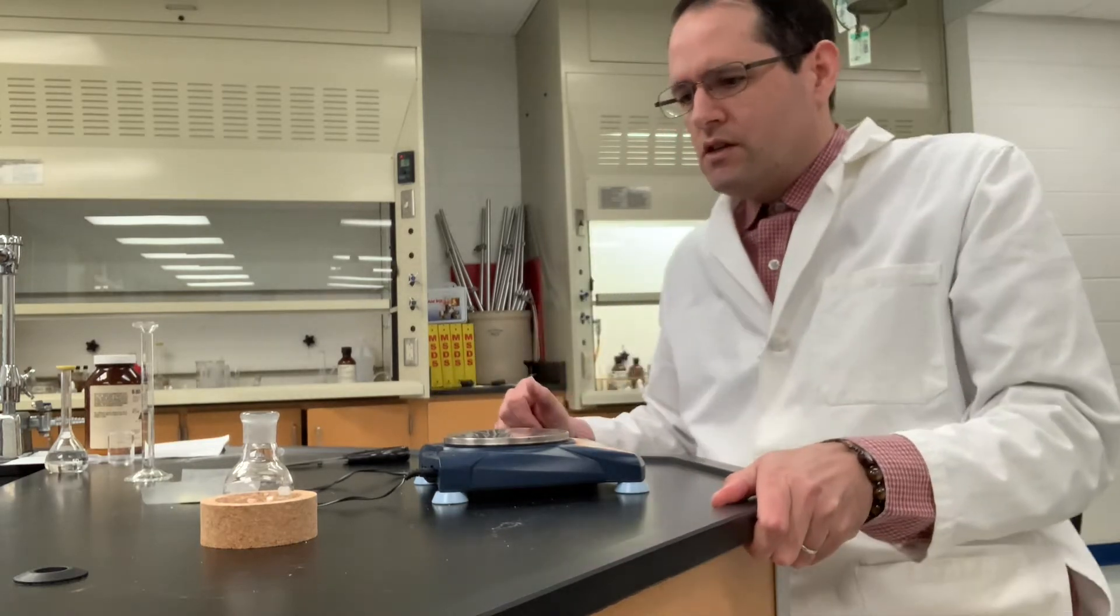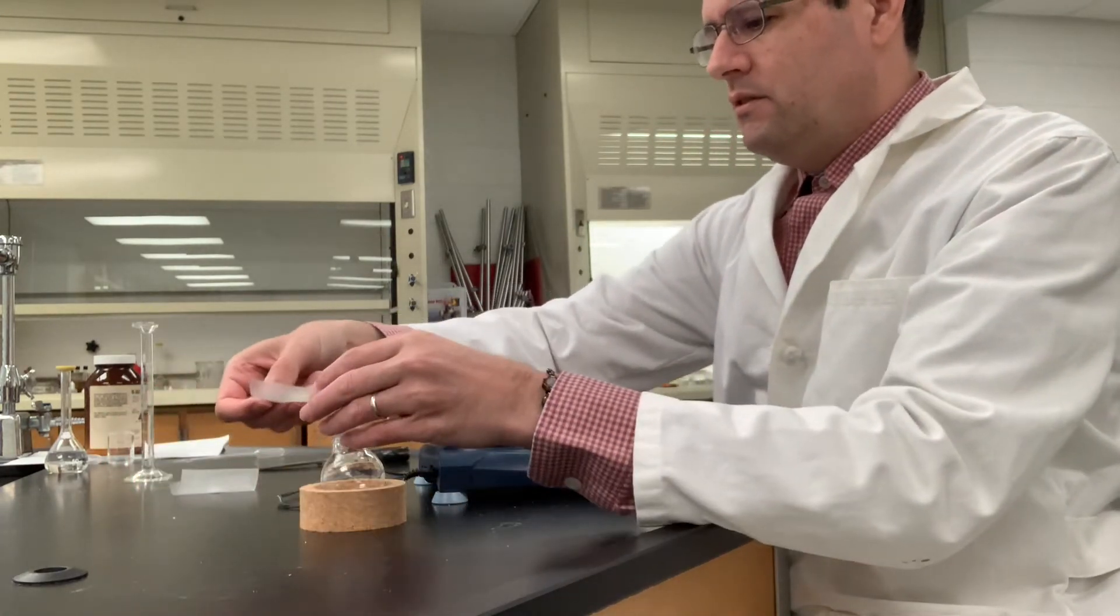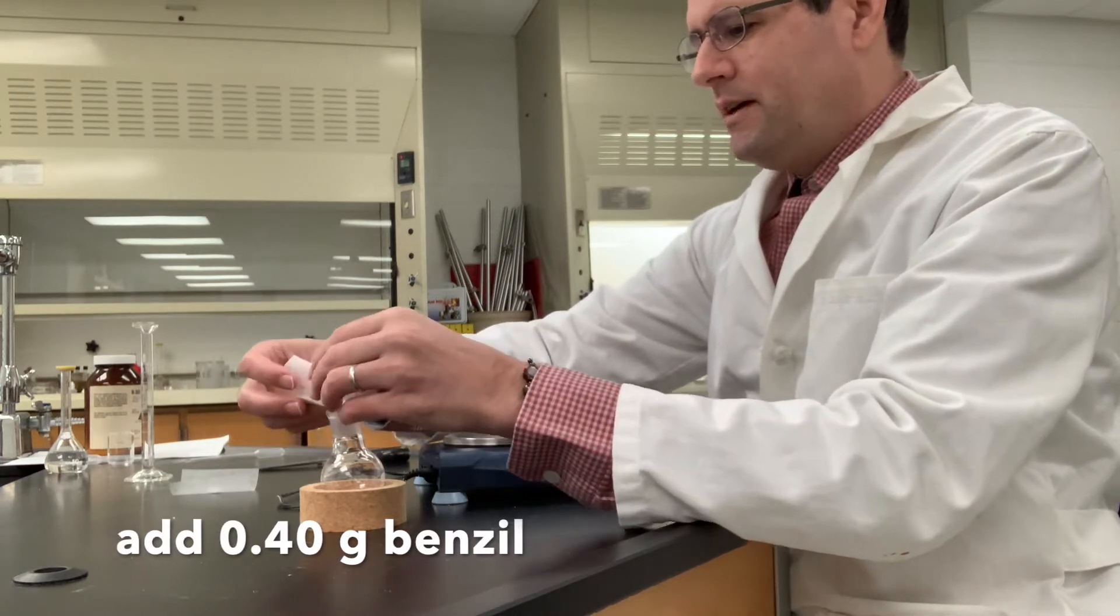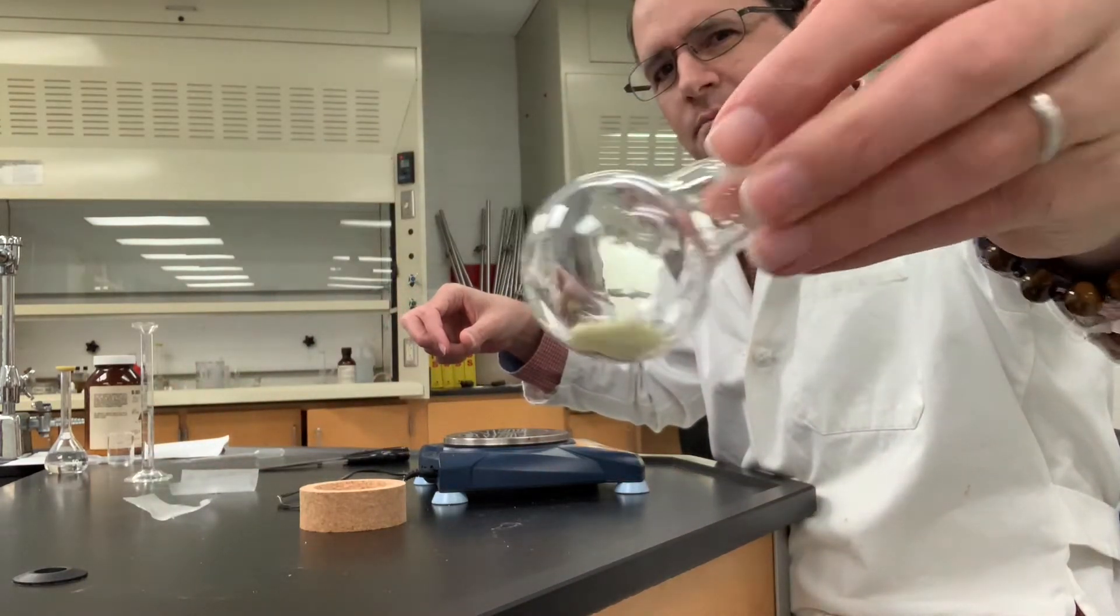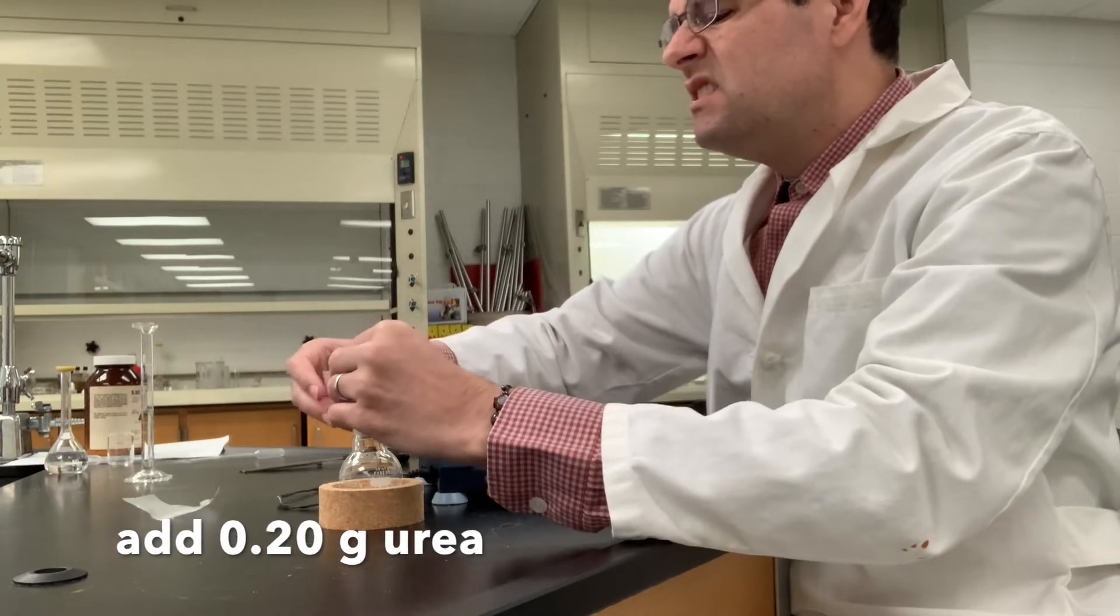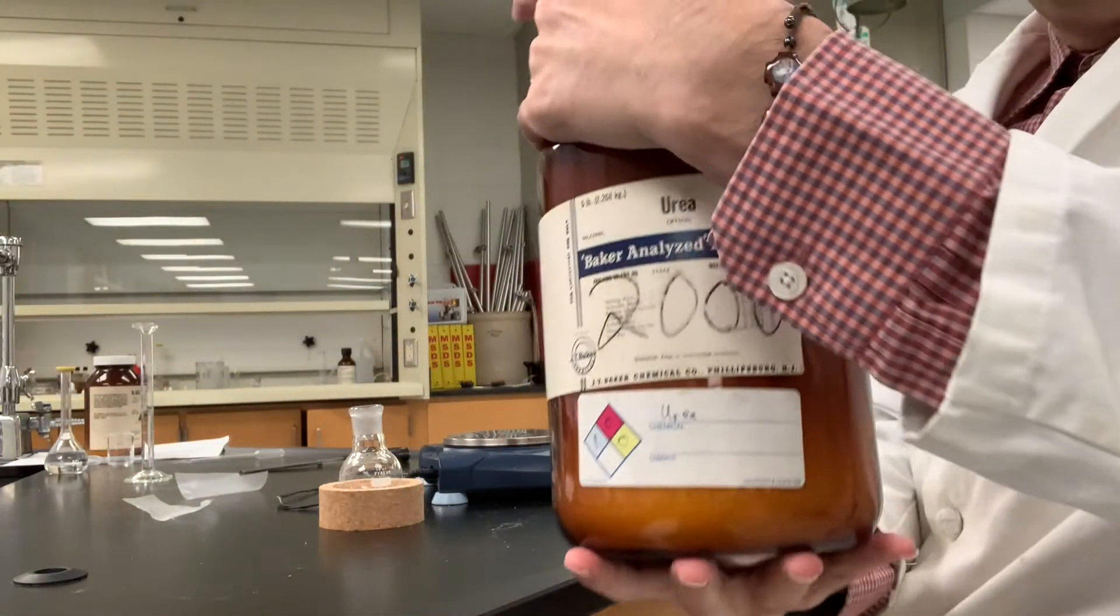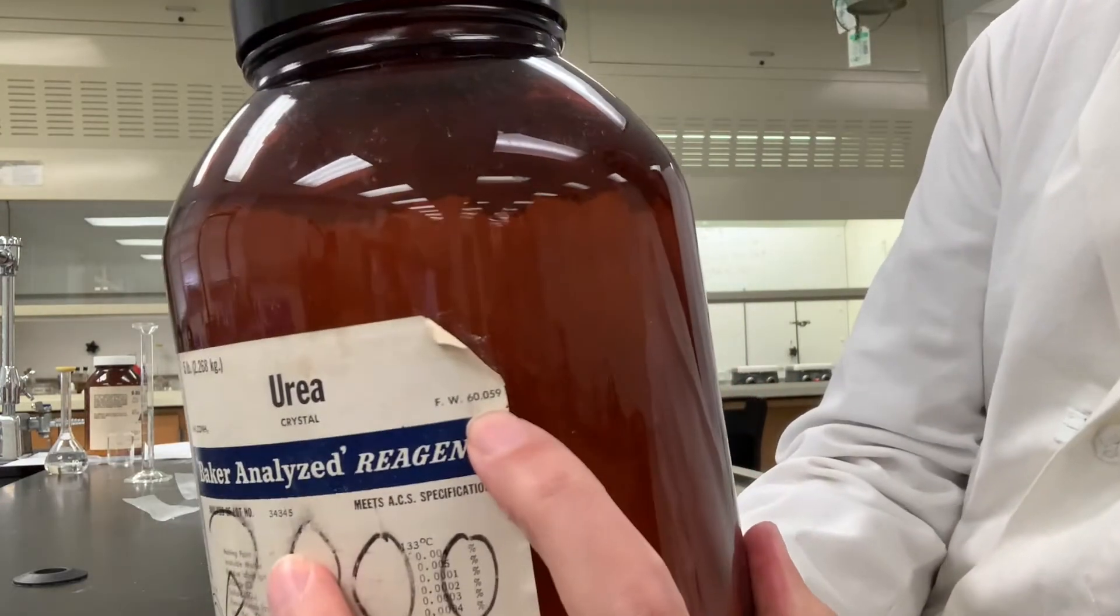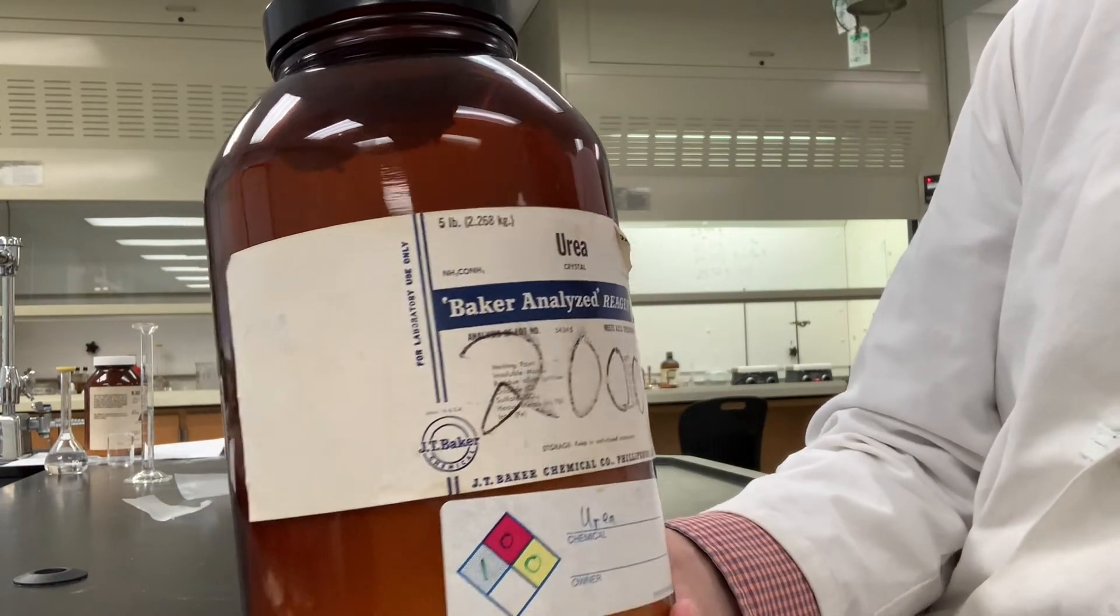We're going to grab a 50 milliliter round bottom flask and add 0.40 grams of benzil that we made in the previous lab. Benzil has this bright yellow color to it. We're going to add urea, which is a fertilizer also used in synthesis. Normally I hold these bottles up so you can see the formula weight and information about the bottle - this is a five pound bottle, so certainly plenty.